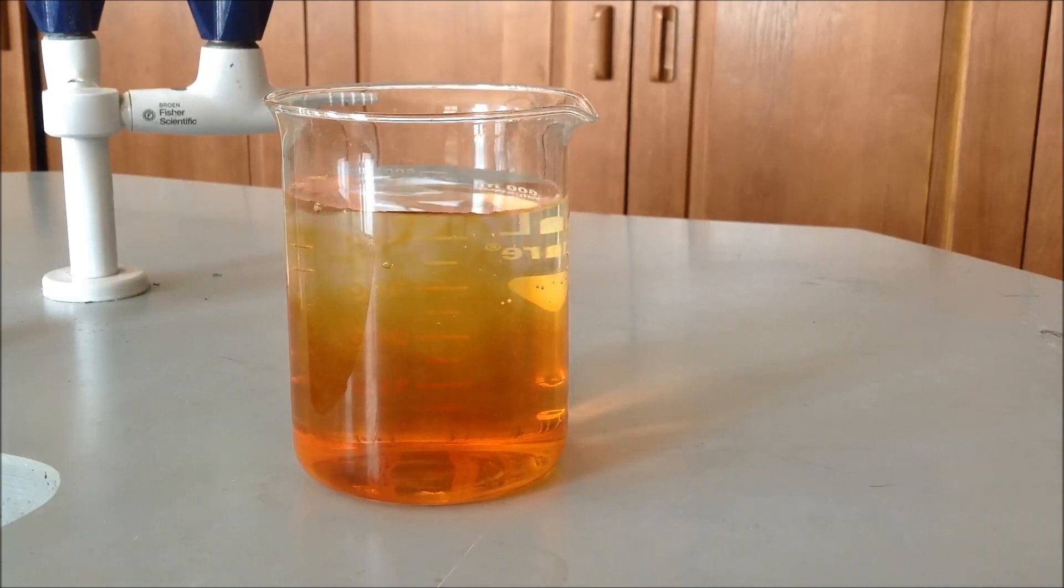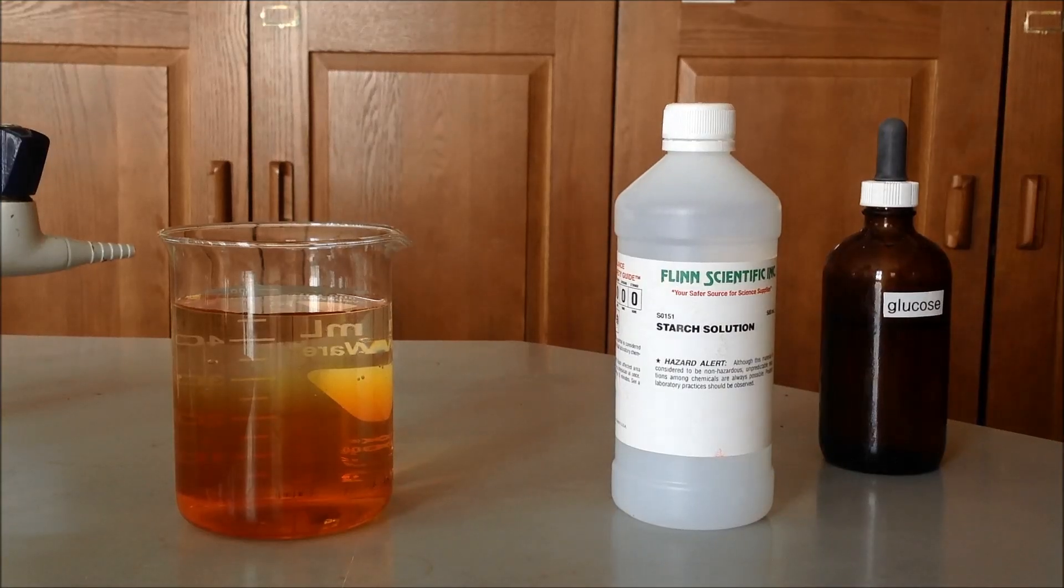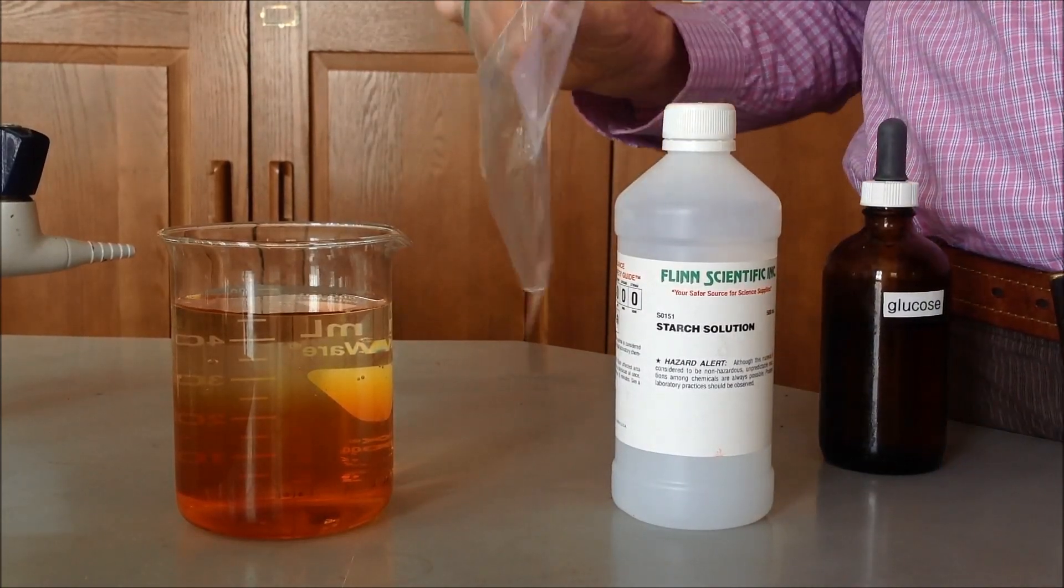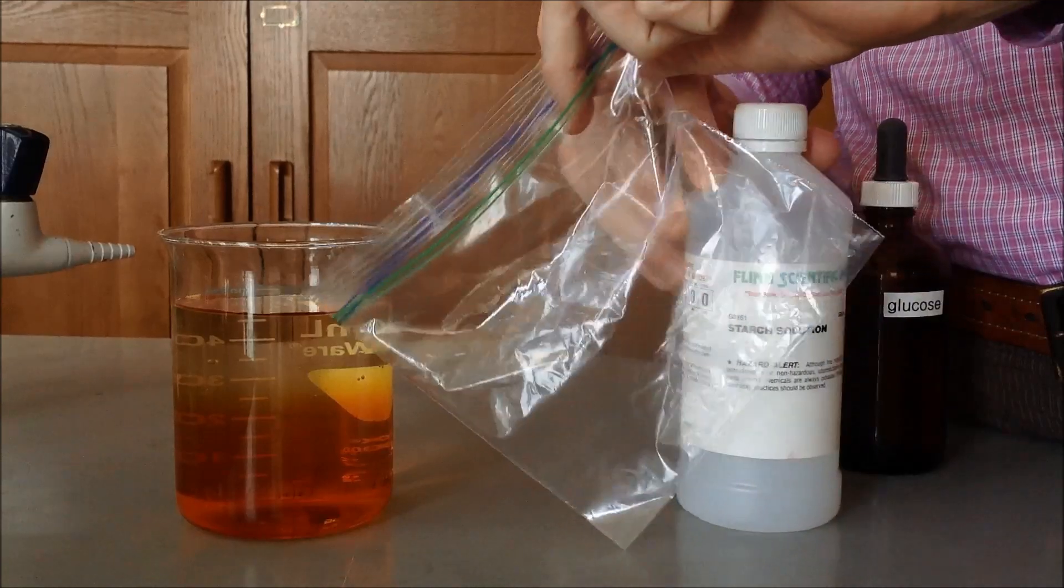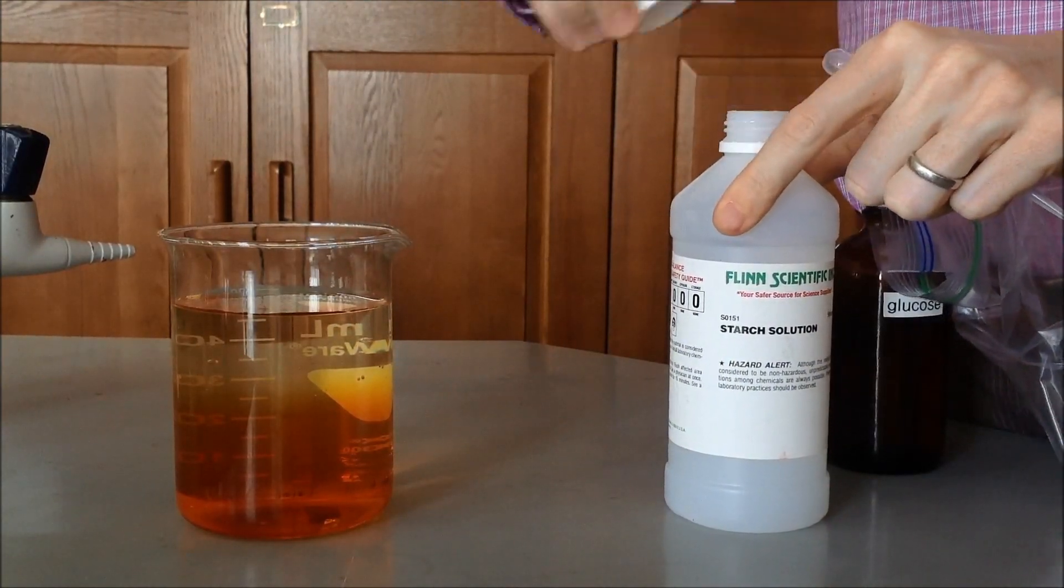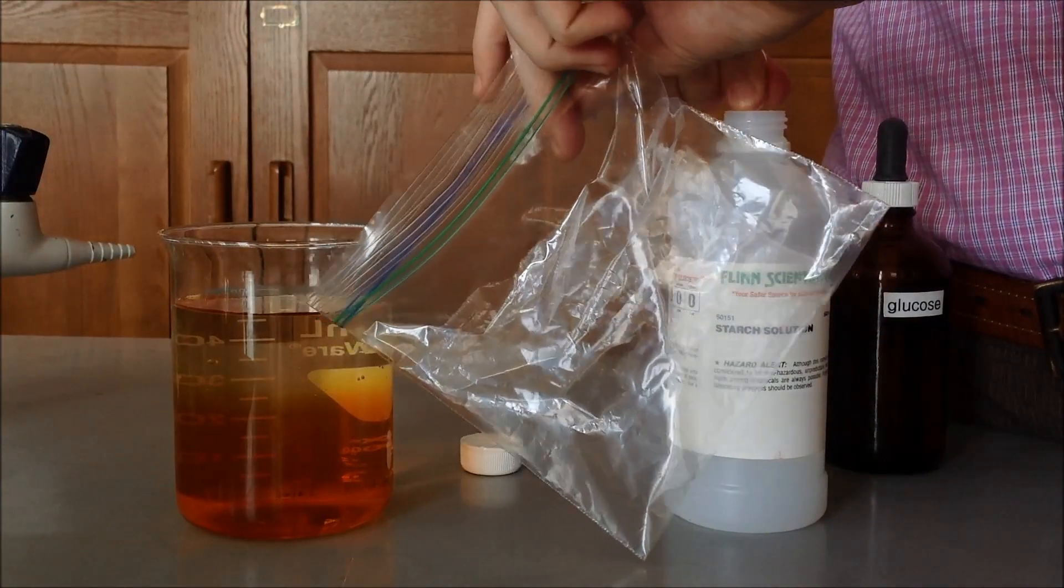The next part of the procedure is to add the starch solution and the glucose solution to the Ziploc bag which is our model for a membrane. So first we'll add the starch solution, you can make your observations of that, and then we'll add the glucose solution. We'll be adding about the same amount of both to the bag.